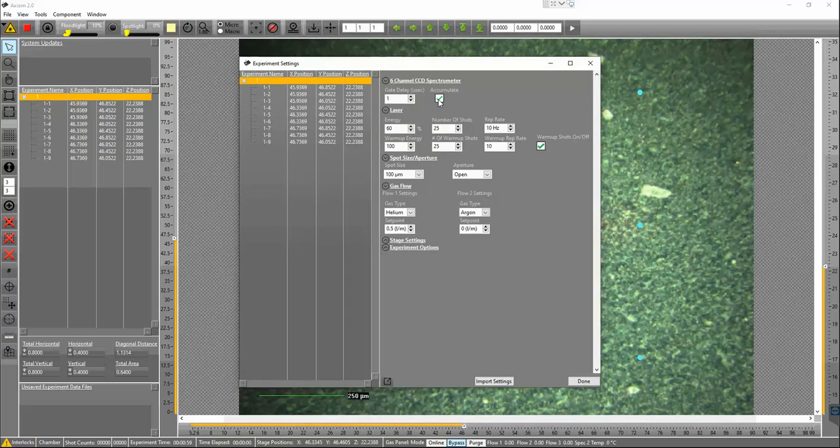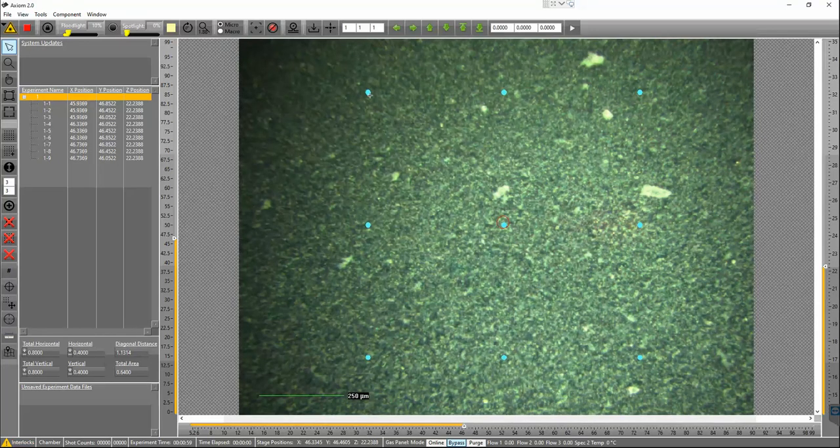Now, the important thing about setting your pattern up to move from upper left to bottom right is that's the way our data analysis software is set up to parse the data for 3D mapping. So it's important to set your pattern up so that it's going top to bottom, left to right. Over here, you can see this arrow. So pattern direction, right click for snake option.